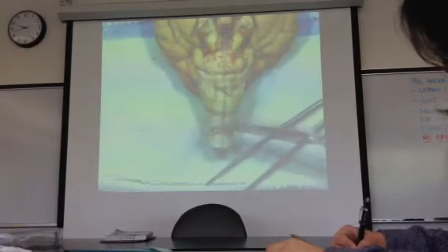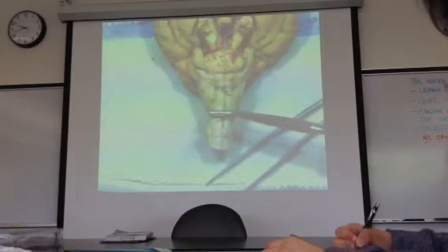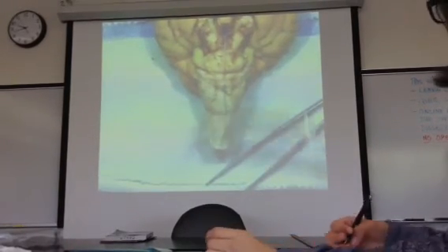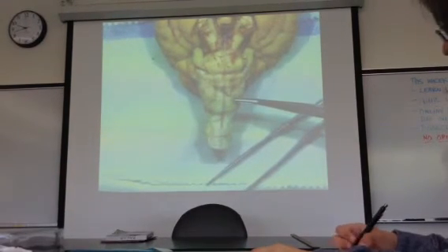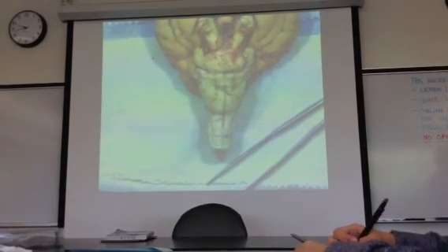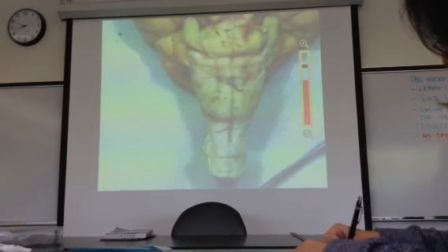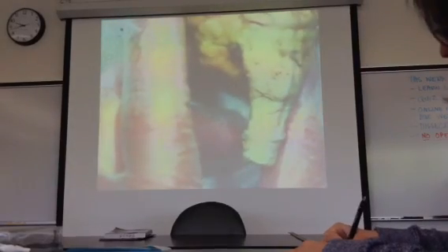What's this thing at the end? Spinal cord. Do you see this thickened region of the brain that links up with the spinal cord? This thickened area between the spinal cord and the pons? This is called the medulla oblongata. Now, if you look closely, between the medulla oblongata and the pons, you will find cranial nerve 6, which is abducens. There we go.